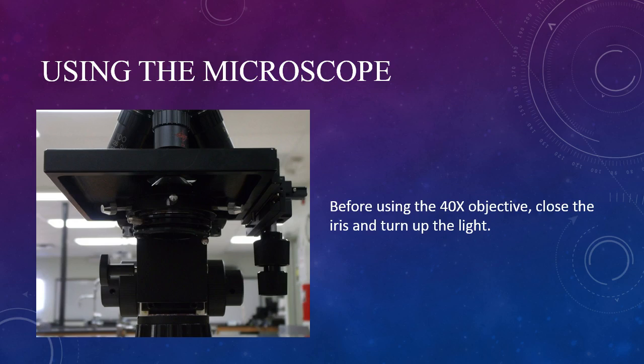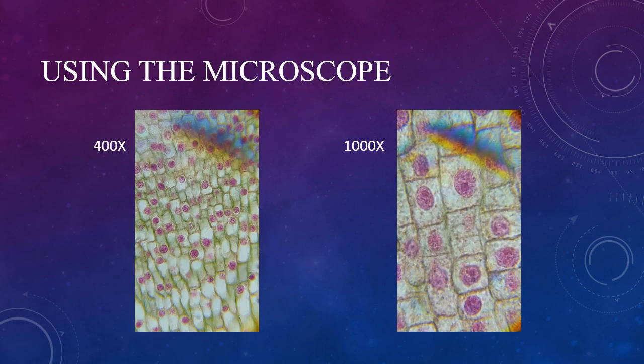If it doesn't slide easily, it's the wrong peg. Closing the iris and increasing the light will give us better contrast as we get to higher magnifications. With 400x total magnification, the structures inside the nucleus are visible, and we can identify different phases of mitosis.